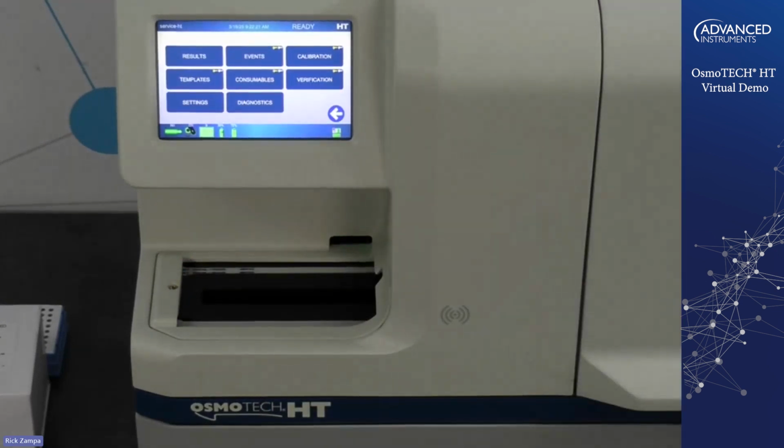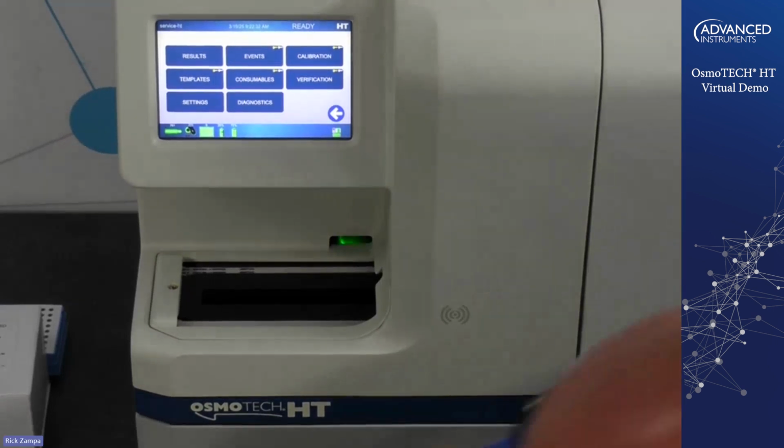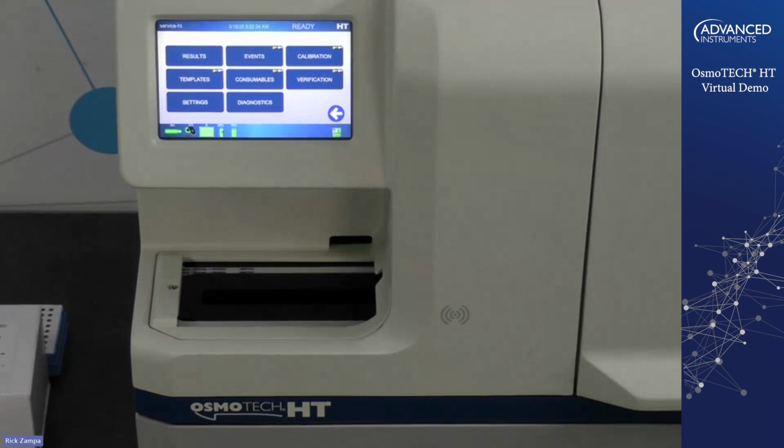You can also always put controls into your 96 well plate, of course, and you could just, as I showed you on the templates, tell the system it's a control, and then you'd be able to put control data into your results database and your controls database as well.